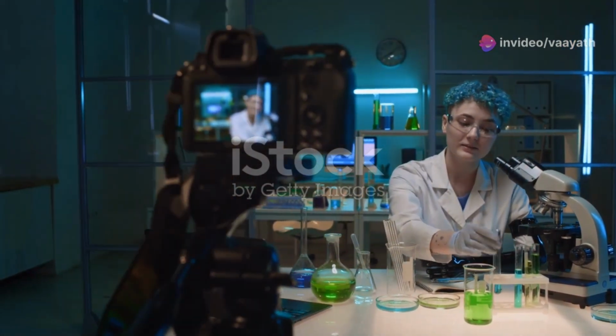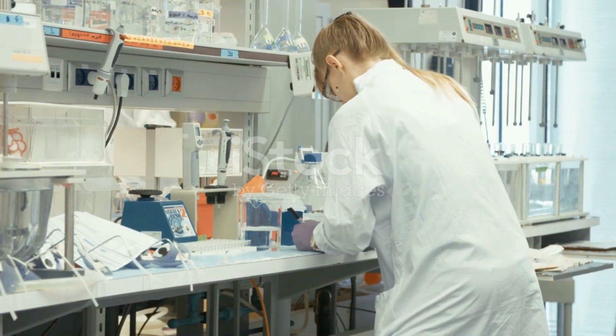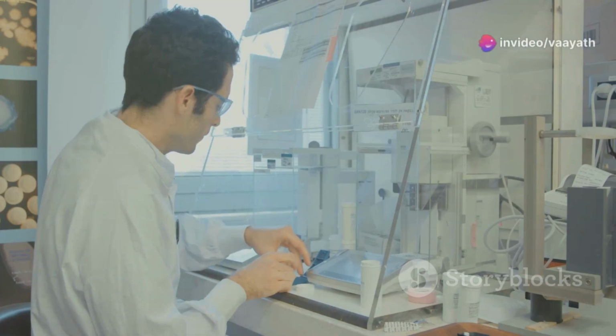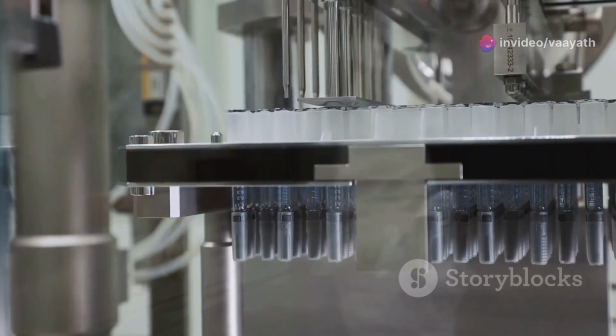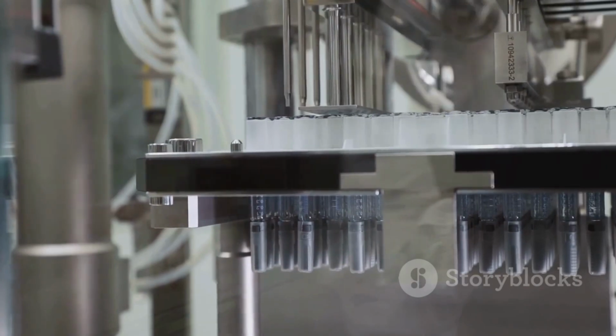Section 5. Step-by-step process of media fill validation. The media fill validation process involves a series of carefully orchestrated steps. First, the media is prepared and sterilized, mimicking the actual drug preparation process. Next, the sterilized media is filled into containers, simulating the filling process of the final product.